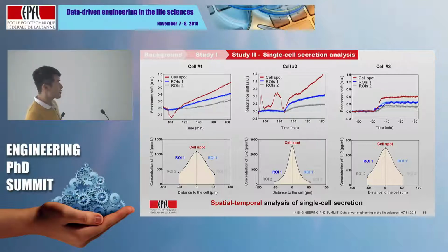First, I'll answer the question about the light source. We didn't use a laser. We used a halogen lamp to provide broadband illumination, and later on we used an LED source, because we are afraid that a laser may be too powerful and induce temperature change or harm to the cells. In terms of microenvironment, yes, we are studying that.